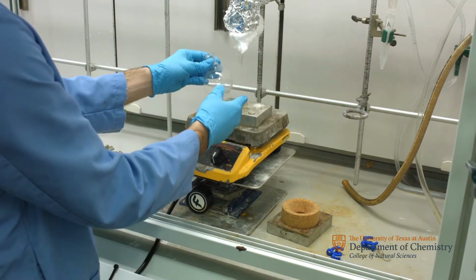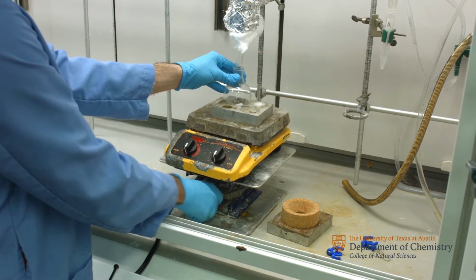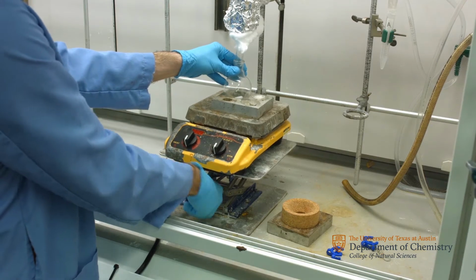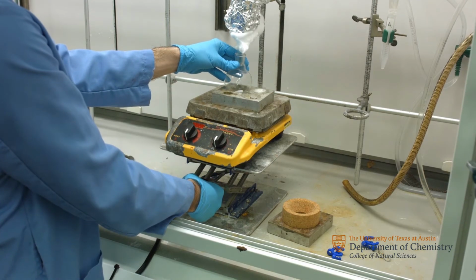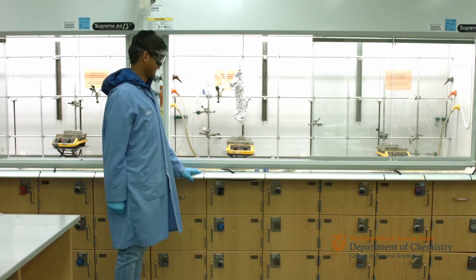Place the 100 milliliter round bottom flask into the largest hole in the aluminum heating block that is centered on the hot plate. Slowly raise it up with the lab jack until the round bottom is attached to the column. Once finished, get your TA to check out your setup.